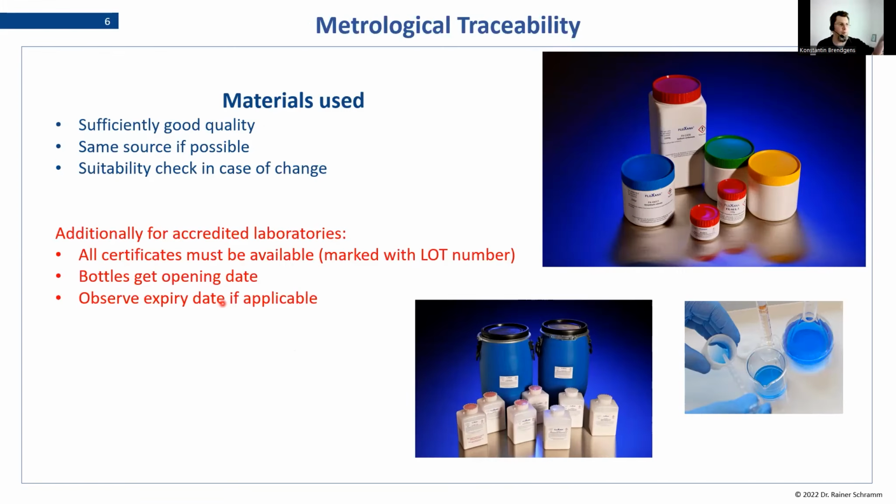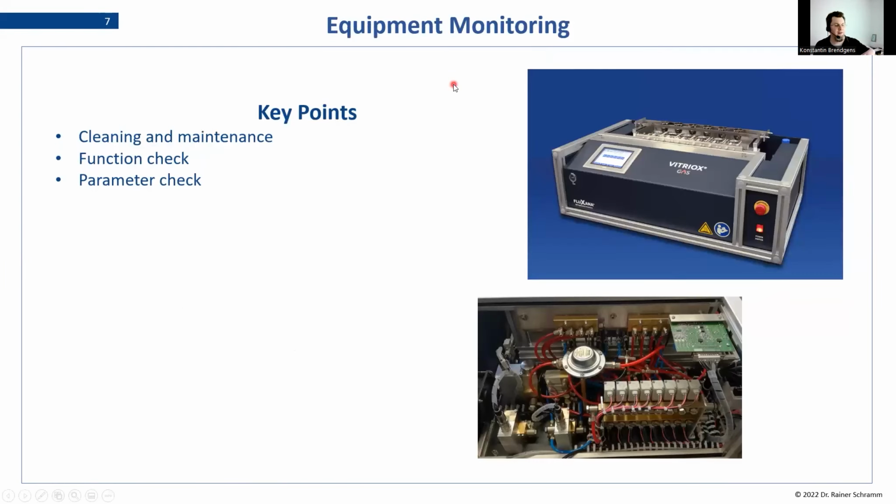Yeah, that was the whole part about the metrological traceability. We'll go into the sample preparation side now. So we've made sure that we have it all traceable back to the base units by the first steps. And now we're coming to sample preparation.